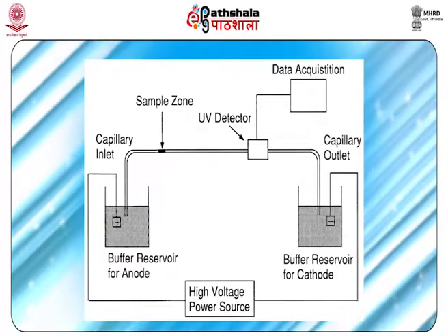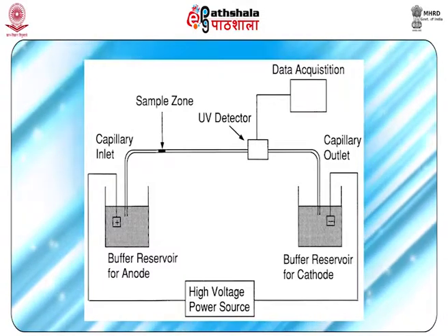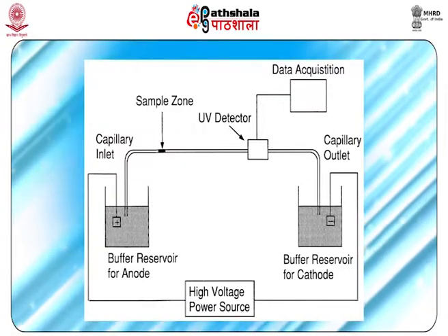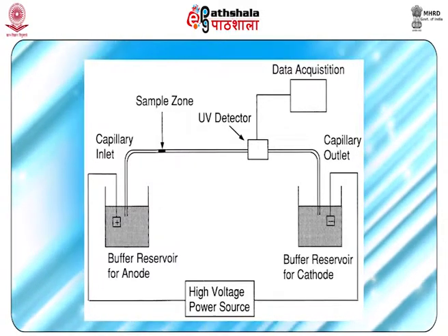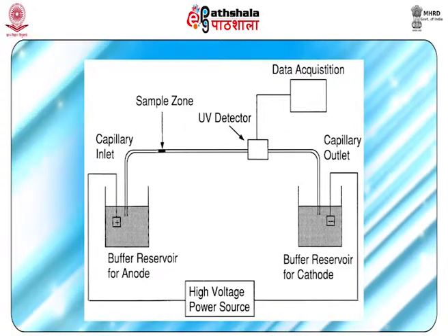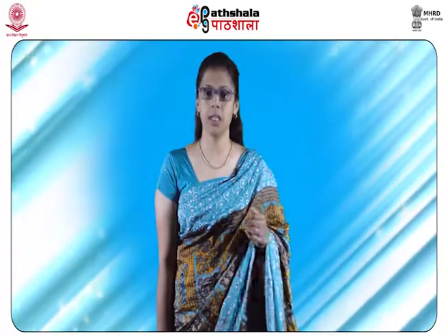Capillary electrophoresis describes a cluster of techniques where separation of components of a chemical mixture occurs in a narrow bore capillary under an electric field. Separation in capillary electrophoresis is based upon the migration of charged particles through a fused silica capillary filled with background electrolyte. Detection is usually by ultraviolet visible absorbance spectrophotometry, resulting in a graph similar to chromatographic separation, also known as an electropherogram.